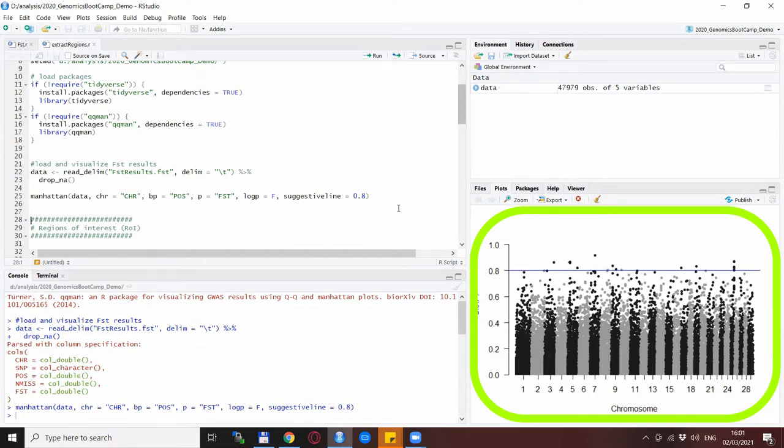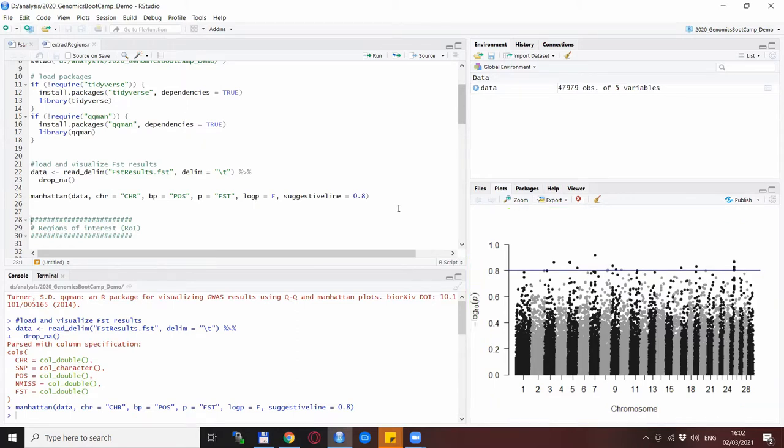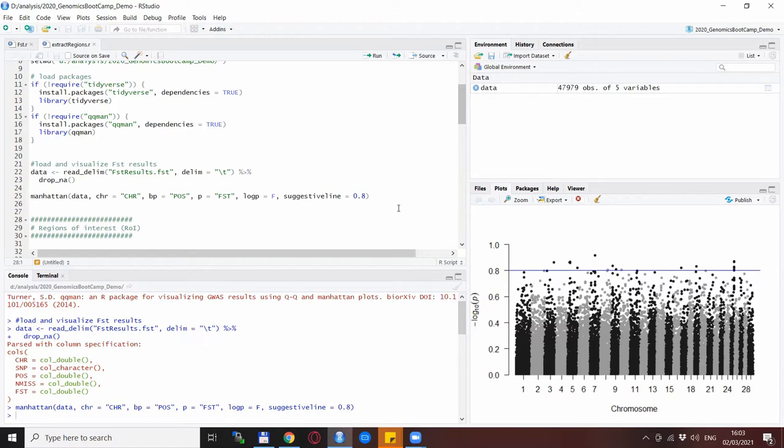We can specify in which SNPs or in which genomic regions we are interested in. The 0.8 threshold is just a subjective limitation I put in to identify the regions that are in highest FST between the two breeds.